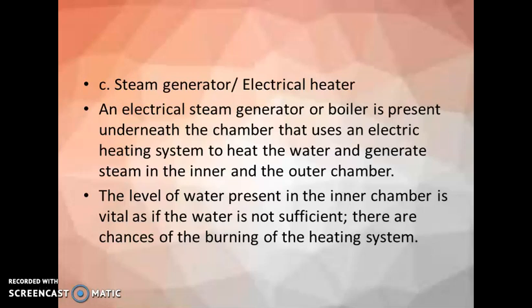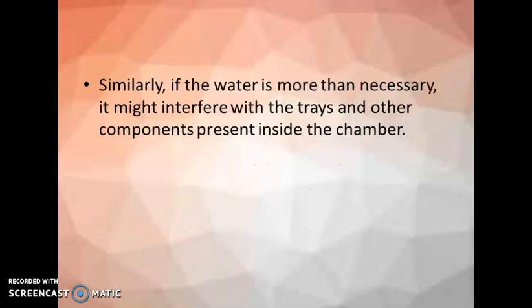The level of water present in the inner chamber is vital. What if the water is not sufficient? There are chances of burning of the heating system. Similarly, if the water is more than necessary, what happens? It might interfere with the tray and other components present inside the chamber.